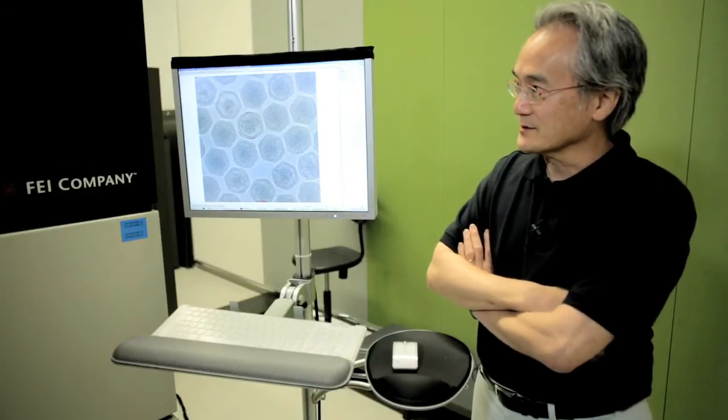With this microscope, we can look at very tiny things like this virus. This is a fish virus. It's one of the largest viruses that we know about.